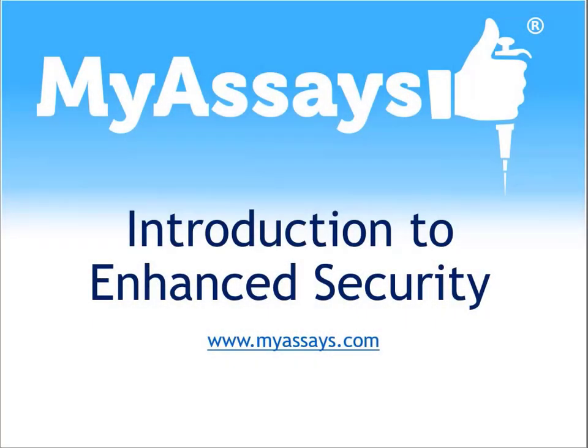In this video, I'll present an overview of the features available in the Enhanced Security Edition of MyAssays Desktop Pro. The Security Edition provides features designed to satisfy the regulatory requirements when working in GxP or 21CFR11 environments. This edition tracks and controls access to software features and data to satisfy these requirements.